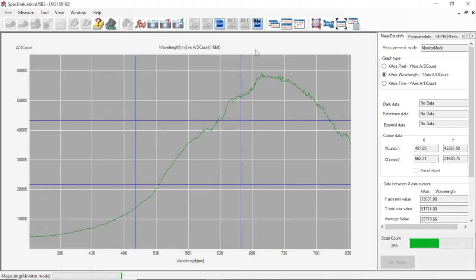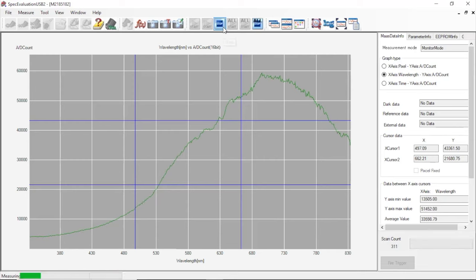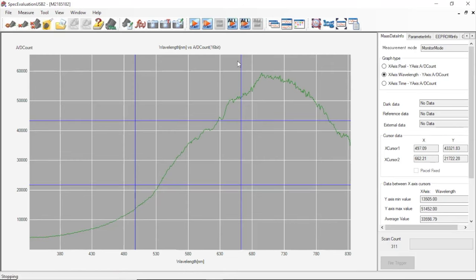Now that we've monitored output, we can move on to start taking measurements that will be saved for analysis. For today, we'll find the signal-to-noise ratio for this spectrometer.